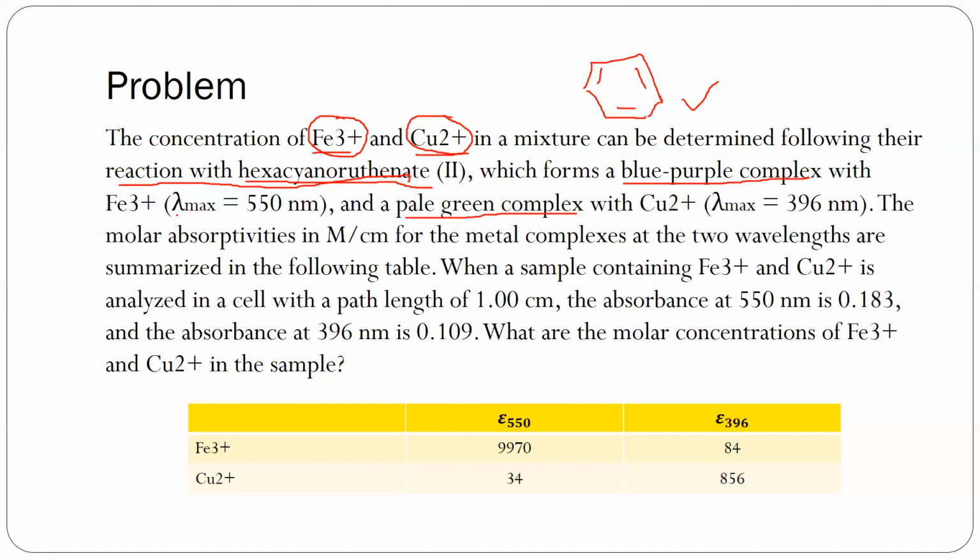Now, you have here the maximum wavelength of absorption. Okay? And magkaiba sila for each of the complexes. Okay. Ang ginagawa kasi, if you have this spectrophotometer equipment, the first step really, of course, maybe after you prepared all the solutions or the samples or the aliquots, ang gagawin mo doon sa equipment is i-scan mo muna siya para malaman mo kung ano yung maximum wavelength of absorption. Kasi yun yung gagamitin mong wavelength.